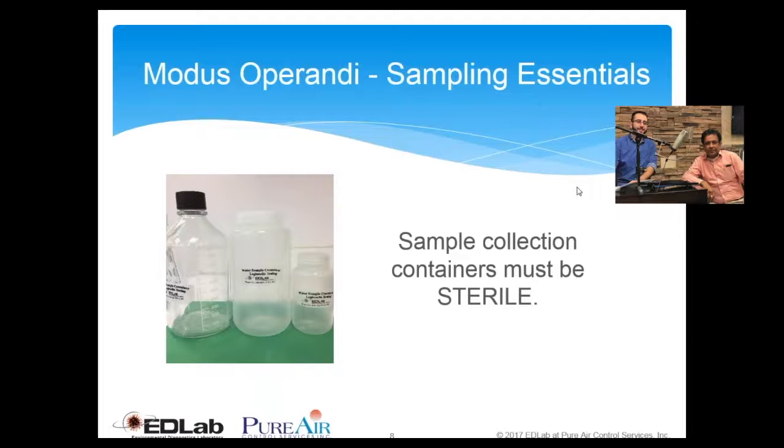And especially, we are talking about microbiology, so we are in hunt of something living, and we don't want to mess with that because we cannot control life, right? So first things first, the sample container used for collecting a Legionella specimen, especially from water, must be sterile. When I say sterile, I mean there should not be any other microbial growth, cross growth, or contamination, and the bottle or container used for collecting Legionella should be clean as a whole.